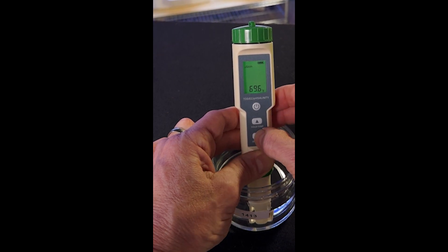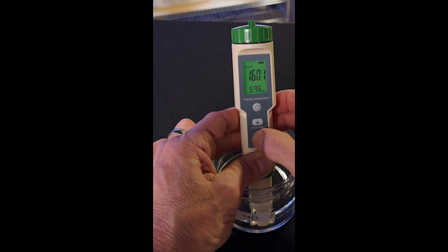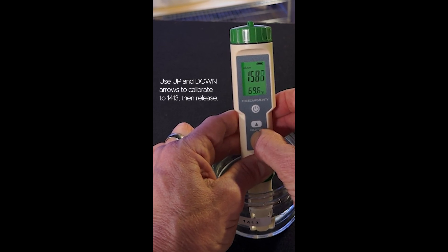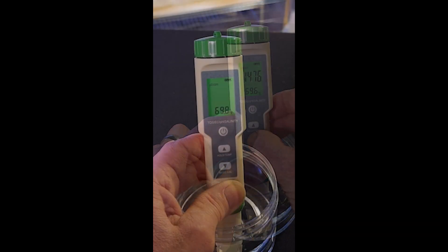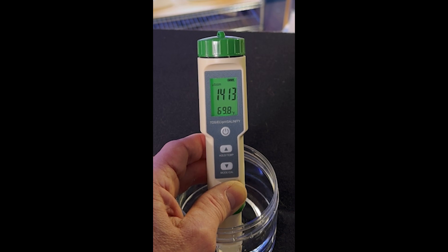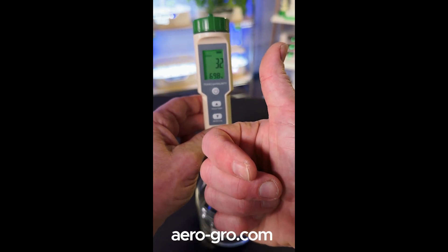While it is blinking, use the up or down arrows to adjust the number on the display until it reaches 1413, and leave it in the solution until it stops blinking. When it stops blinking, you are fully calibrated!